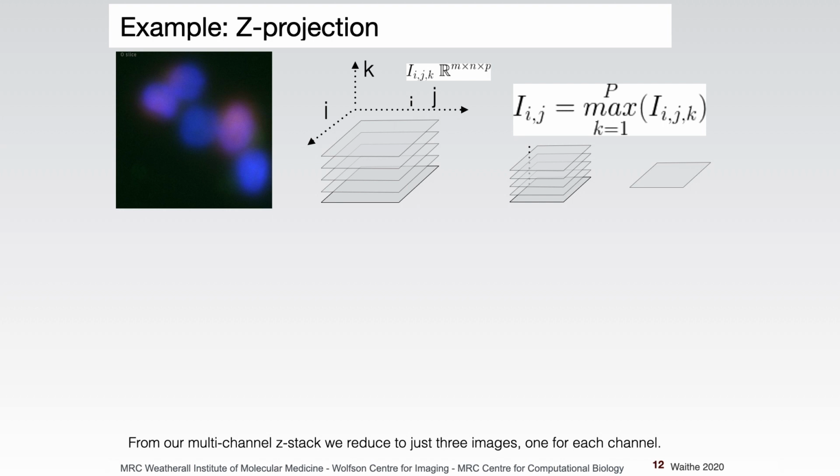But it's up to you to interpret whether that's a risk or not, or whether it's going to do something so dramatic that it really throws your experiment. There would be ways around that. So for example, if you really wanted to get the same pixel in each one, then you could write a script that finds the maximum in one stack and then just make sure it takes the same one from the others. But I don't think you can do that just through the menus. I think you'd have to do that yourself. But that'd be a good challenge.